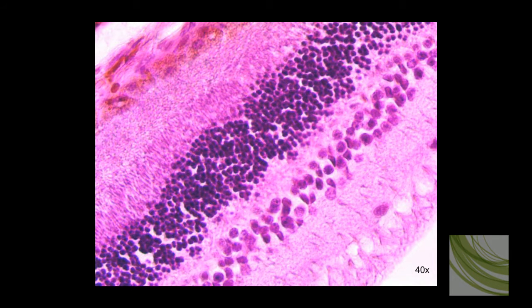Here is the magnification using 40x objectives, and in this we can see a lot of different things. Here we can see the rods and cones layer. We can see the cell bodies and nuclei of the rods and cones. We can see the cell bodies and the bipolar neurons here, and we can see the ganglion cells along this band.